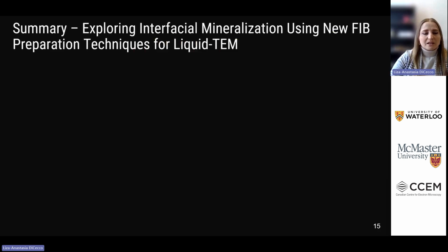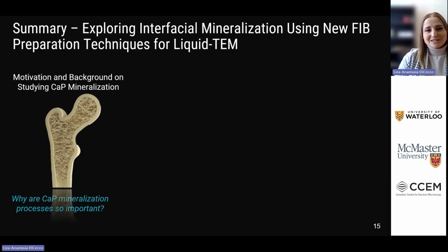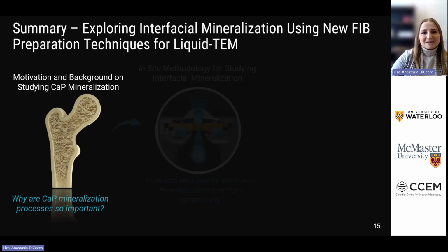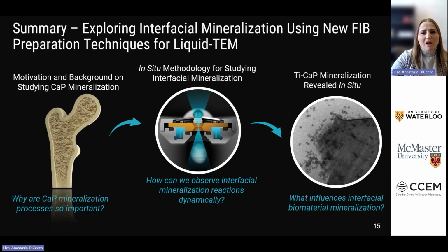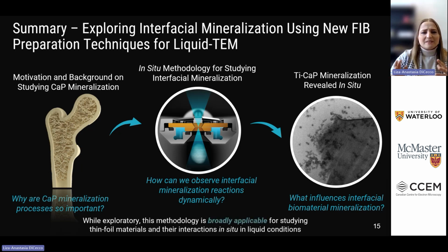So in summary, I hope that you enjoyed the talk. This little flash talk, we covered a bit of a motivation that's a little different, and why we're interested in studying calcium phosphate mineralization processes. I talked about the methodology behind it and how we were able to observe these interfacial reactions. Then we covered some very quick snapshots of the results. Please go to our paper and see more. And the thing I do want to emphasize is, while this is still exploratory, this methodology is broadly applicable for studying thin foil materials and their interactions in situ in liquid conditions.